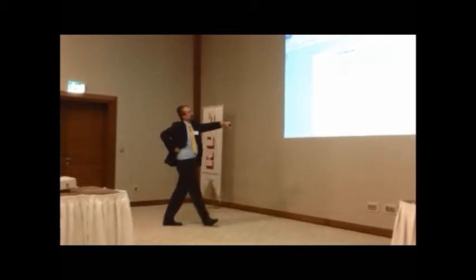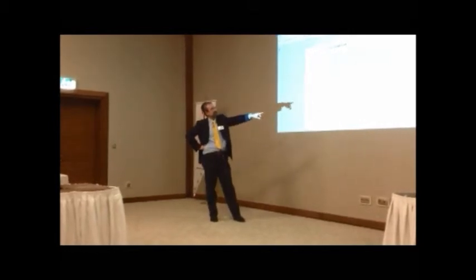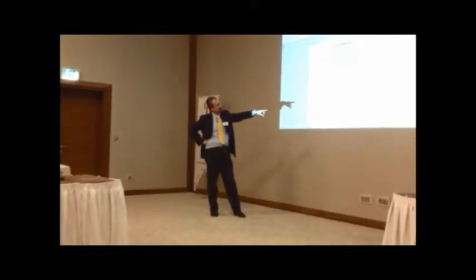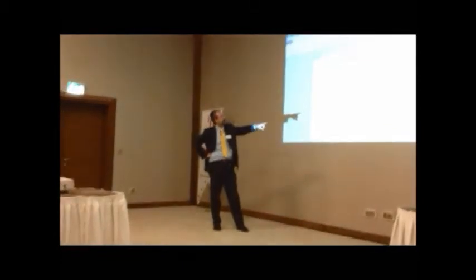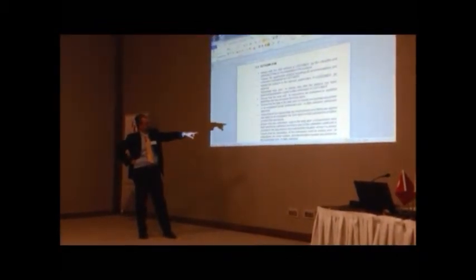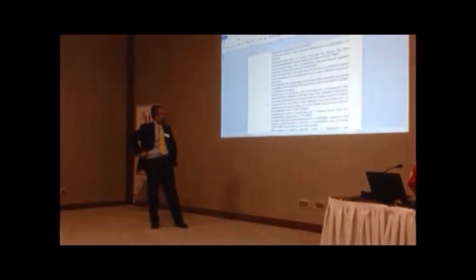Ensure that the instrument we use has a copy of the certificate and it is included in the document. Ensure that the description of the instrument used for testing and for evaluation is printed on the worksheet or data collection. Put together all the results.